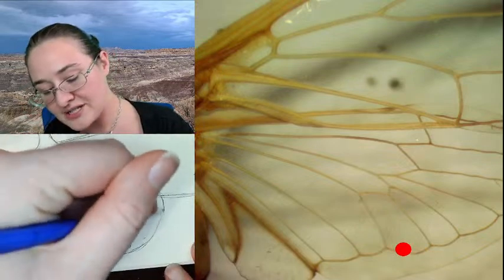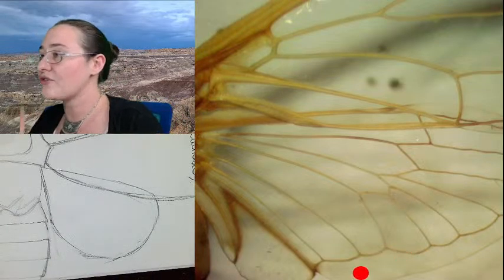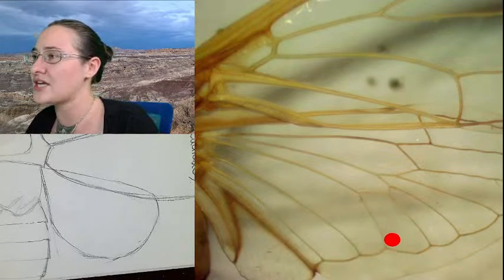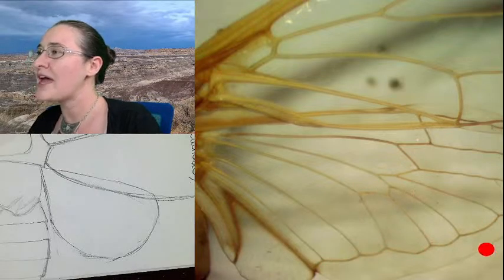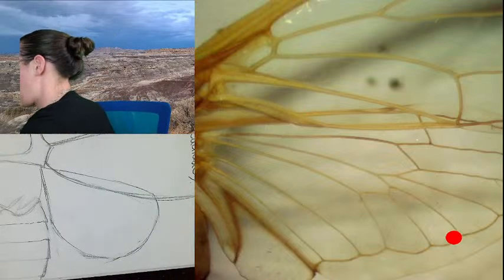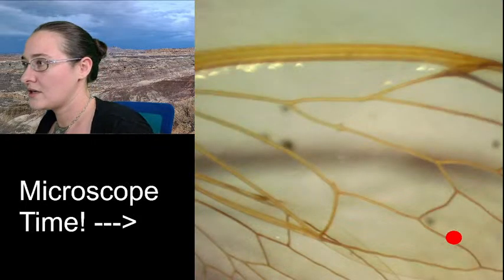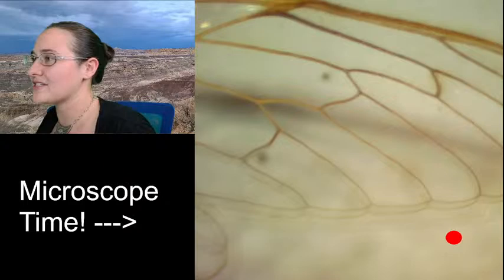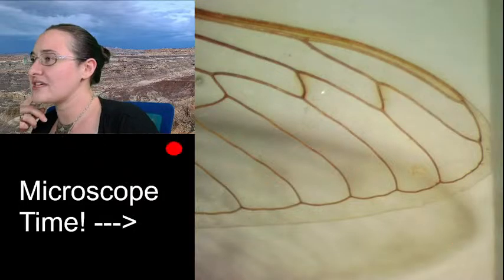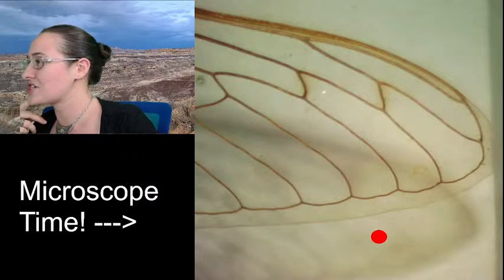One thing to notice is that the wing veins never really reach the edge of the wing. So if you look here, this line right here is the edge of the wing, and all of the wing venations kind of come back in this scalloped form, and they never really touch the edge. And that is the pattern all the way up the specimen. So if we look all the way at the tips of the wings, we can see that all of these cells close, but none of them actually reach the edge.